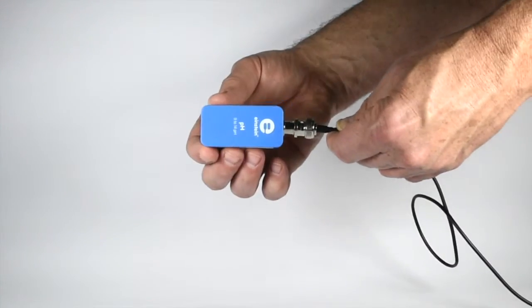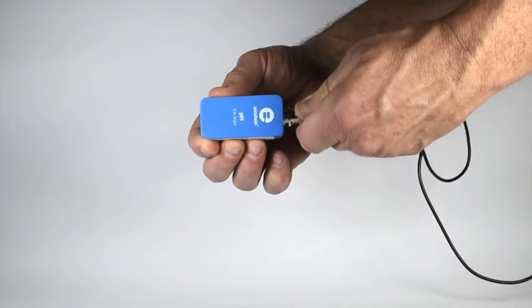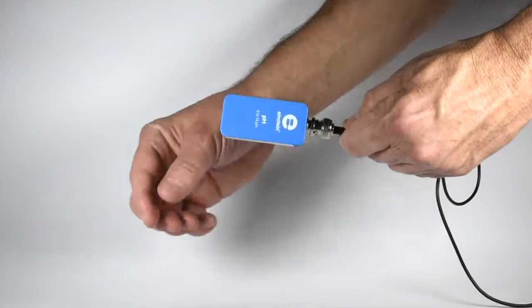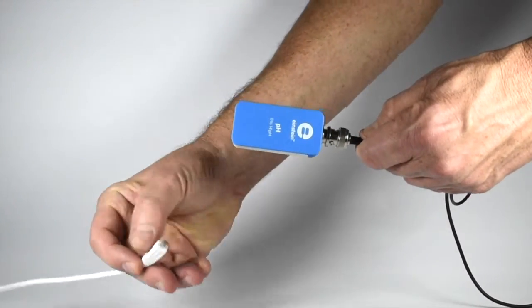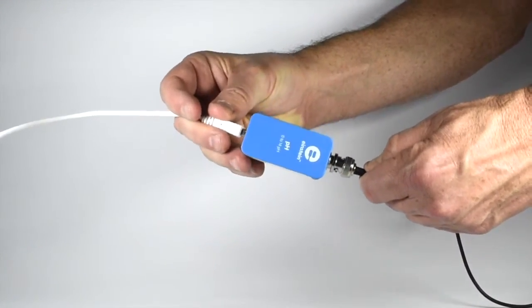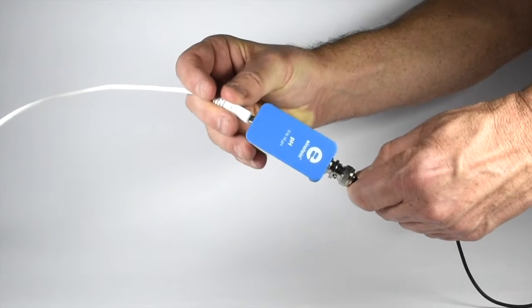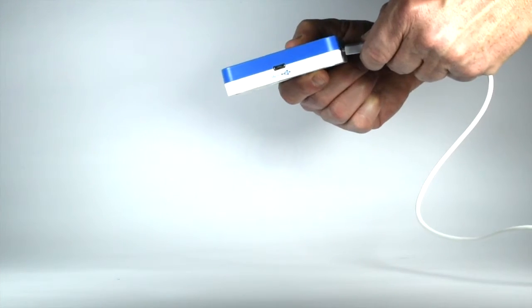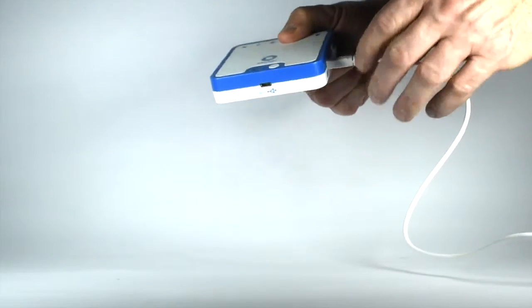To use the pH sensor, first attach the electrode to the sensor. Then attach one end of the cable to the sensor and the other to the sensor ports of your Einstein device.